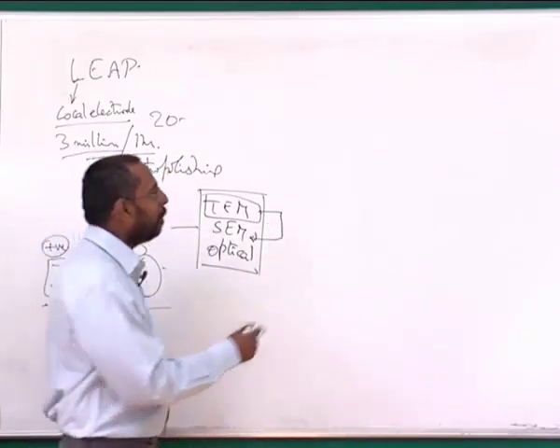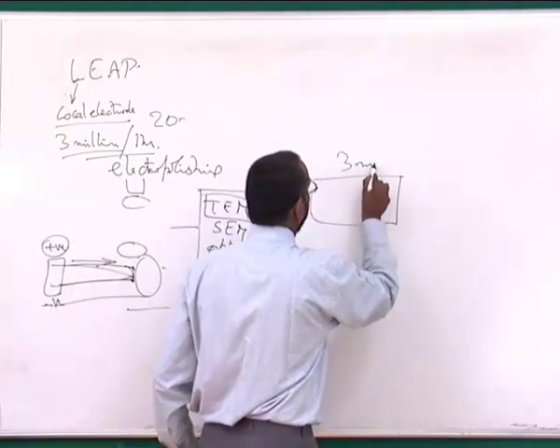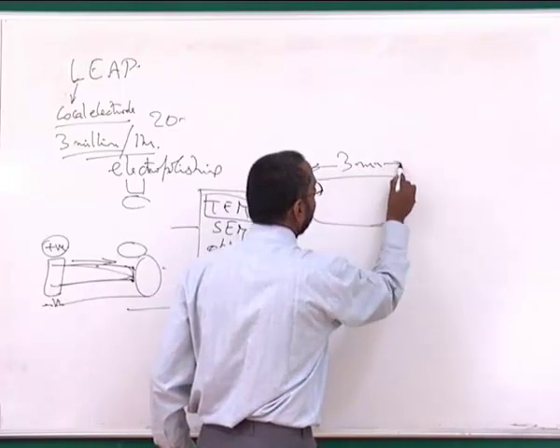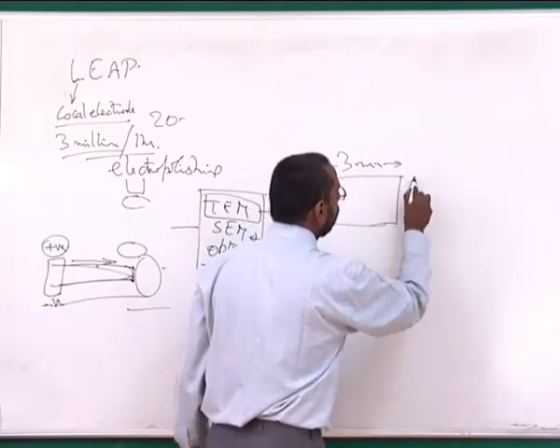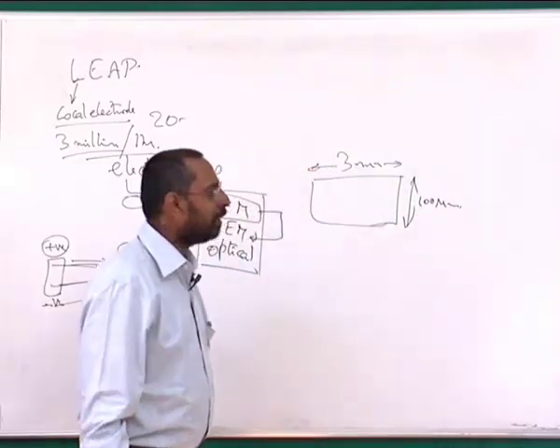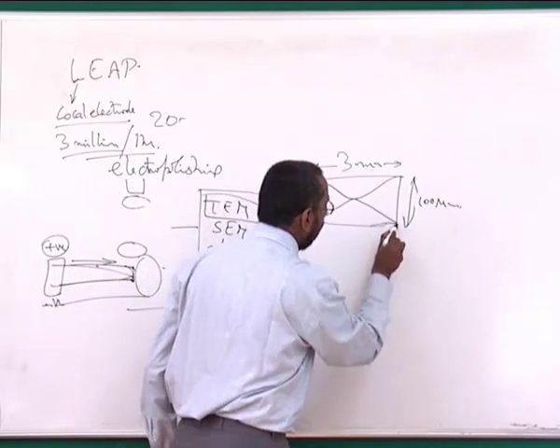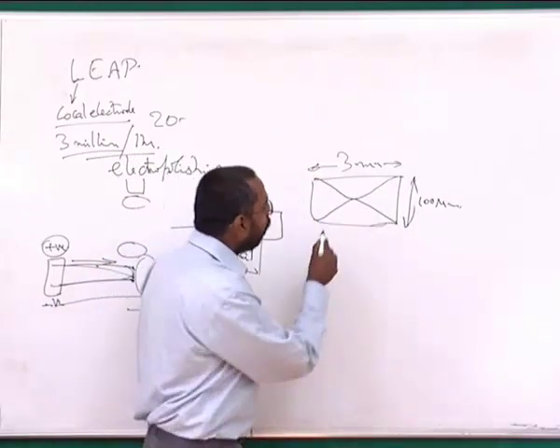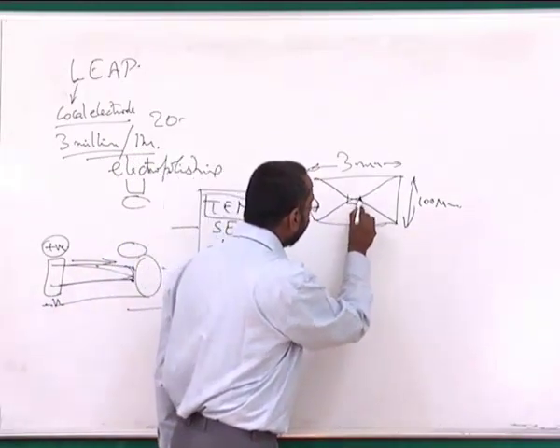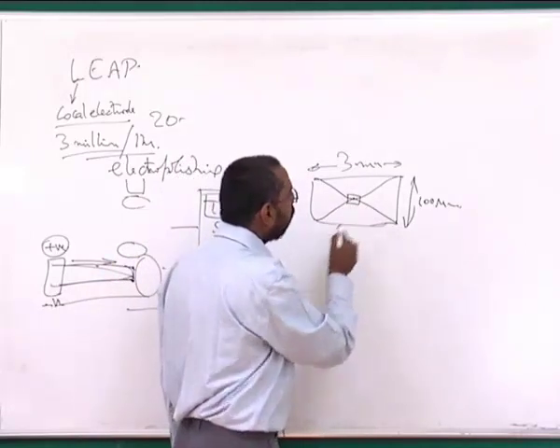Even in a TEM, though I might start with a 3 mm disc, if this is a 3 mm disc with a 100 micron thickness, if this is my starting material, when I do jet polishing, finally what I am looking at is a sample like this, and only a region around this. A hole has formed here, and I am looking at a region around this hole.